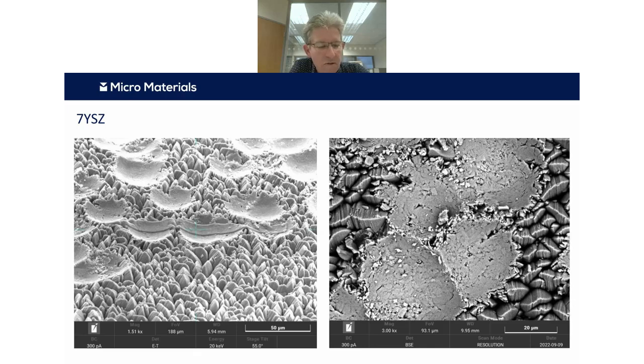So if we look at the sort of damage that we get in these random impact tests, now we can see a couple of different images there. You can see that we're getting the same sort of compaction that we see in the repetitive single impact tests, and also that cracking is occurring between these impacts when they start to be too close to each other, essentially.